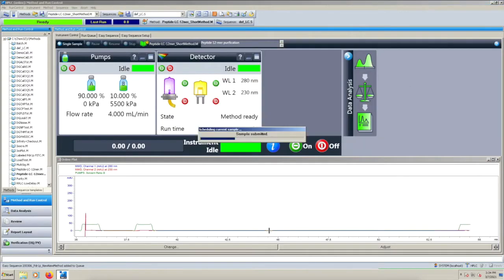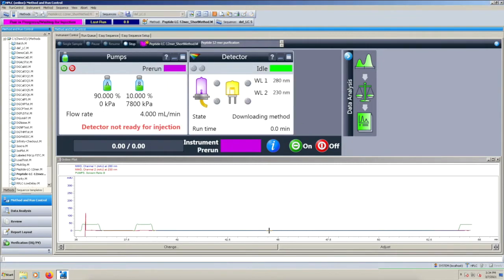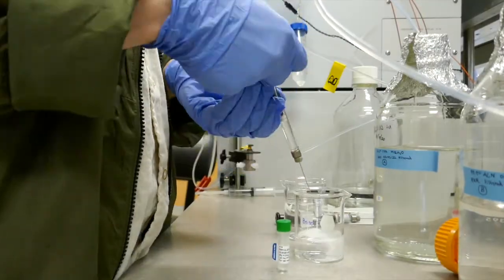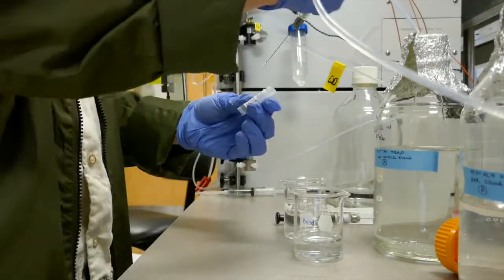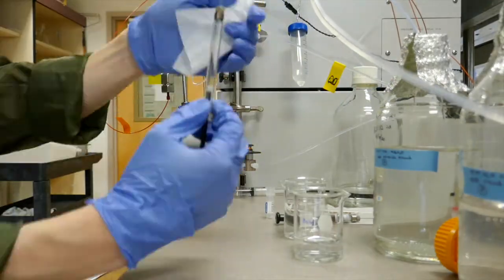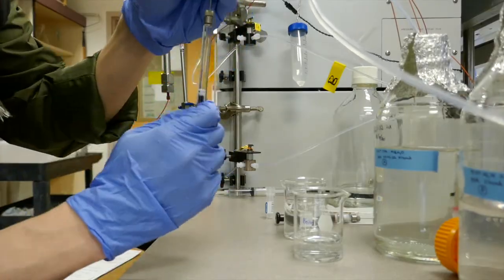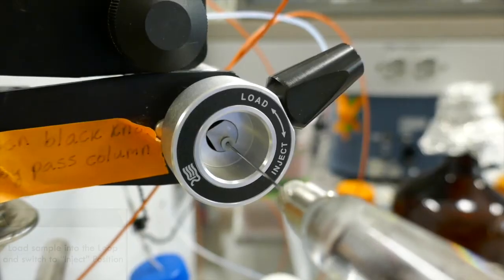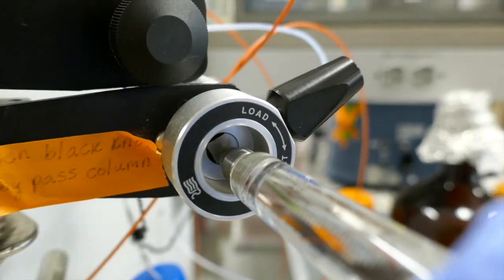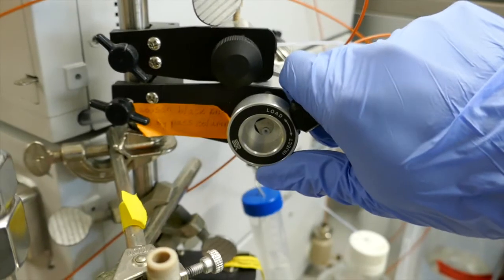After the column is done equilibrating, you can click single sample. Wait for the software to say ready for injection. To start a run, load the injection syringe with your sample. Make sure that you remove any of the bubbles that might be in the syringe. Inject into the loop, remove the syringe, and switch the injection valve to the inject position. That should start the run.